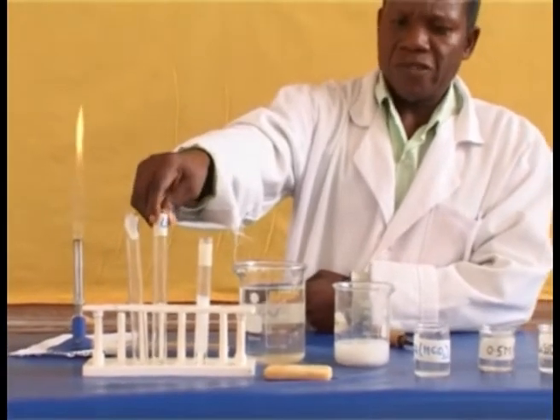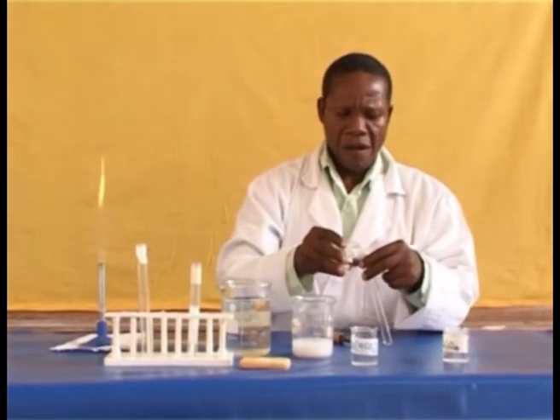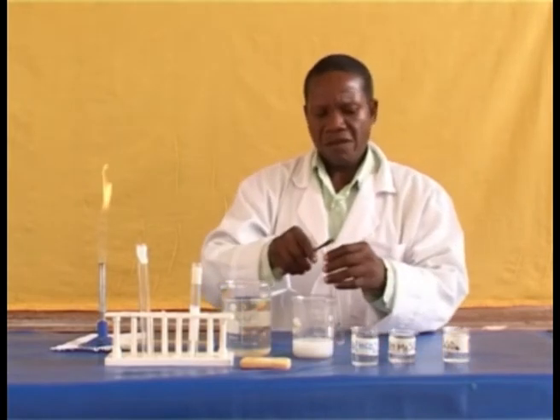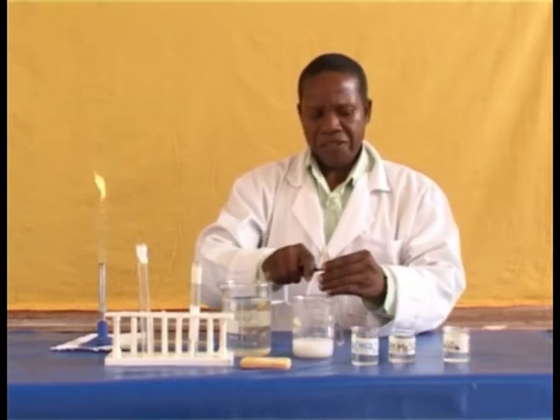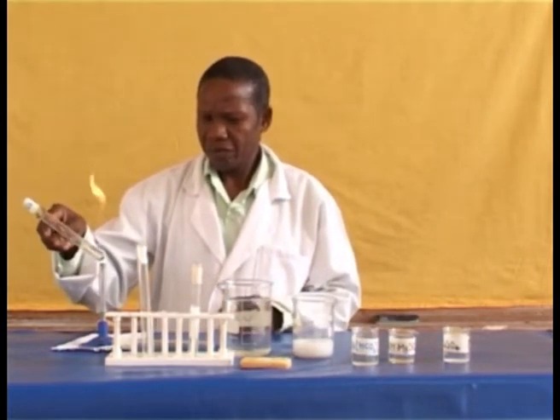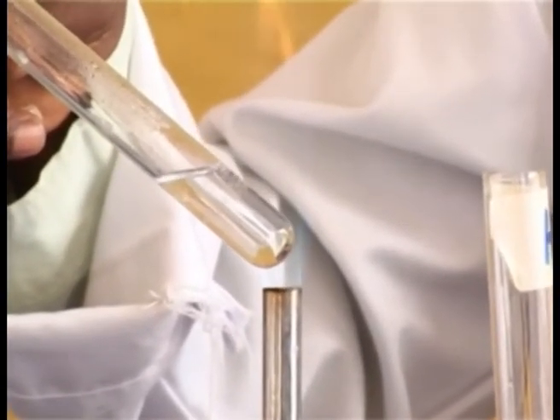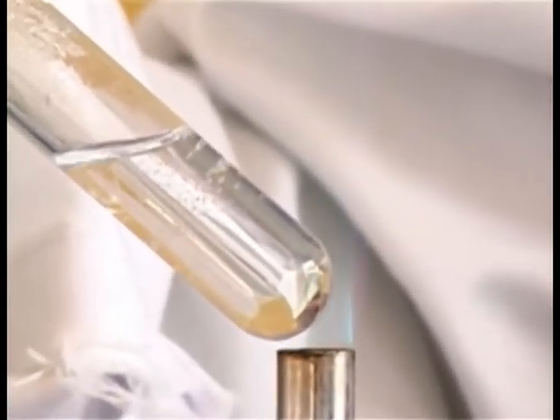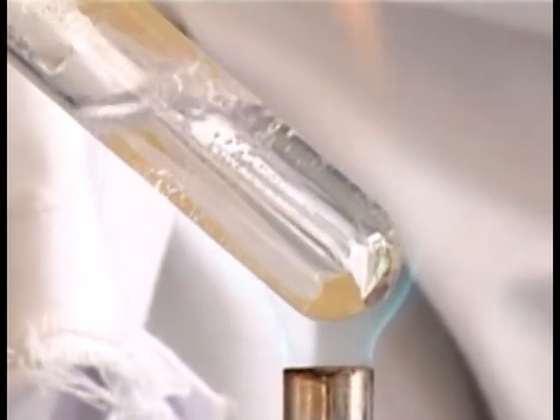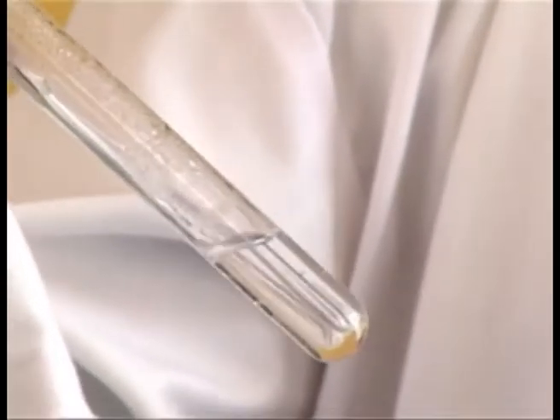Take another test tube. Pour magnesium sulfate solution. Again, boil it. The solution boiled, then allow it to cool.